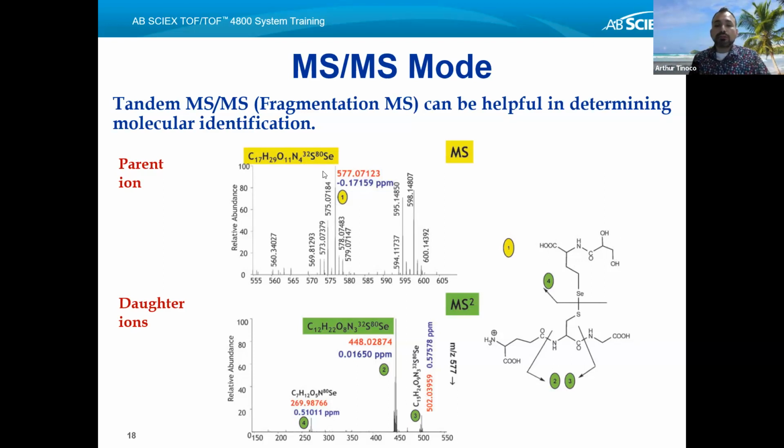All right. So then when you apply the collision-induced dissociation, what you're going to do is break up this molecule. The depiction here is imagining breaking up this molecule into different pieces. There's a break between this carbon-nitrogen bond, leaving this portion of the molecule. That's this peak here, this fragment number 2. Then if you break here between this carbon-nitrogen, you're left with this molecule here. That's this species here. If you break here, you have then the fragment number 4, which is this one here.